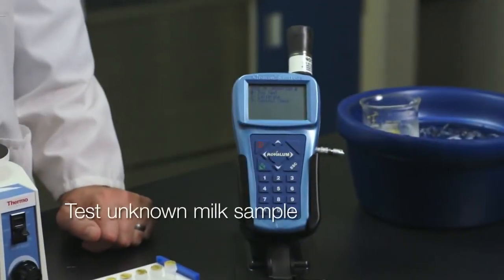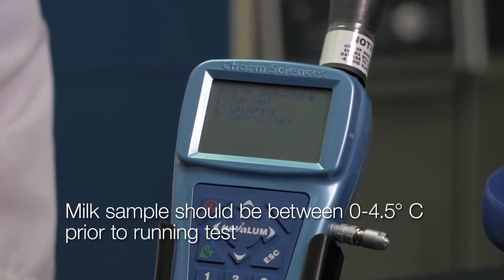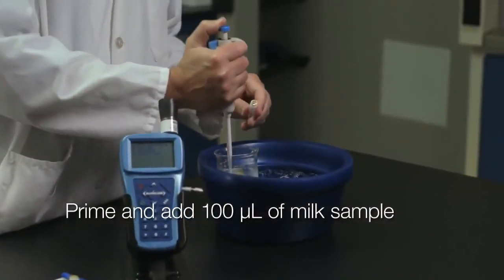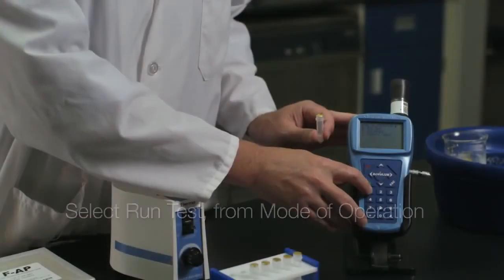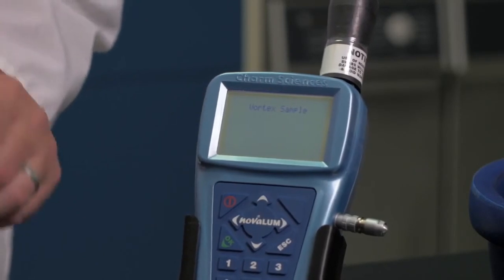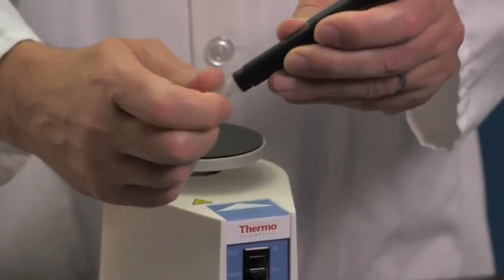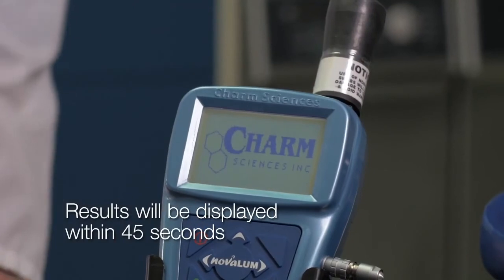Now we'll demonstrate the steps needed to test an unknown milk sample. All milk samples when tested should be between 0 to 4.5 degrees Celsius prior to running the test. Using a new clean pipette tip, pierce the foil top of the FAP vial, prime a pipette tip with your sample and draw 100 microliters. Inject the sample into an FAP vial. Select Run Test from the Mode of Operations screen and press OK. Thoroughly mix your sample on the Vortex mixer for a full 5 seconds, attach the adapter to the FAP vial and insert it into the Novolume. The Novolume will finish analyzing your sample and will display your result automatically.